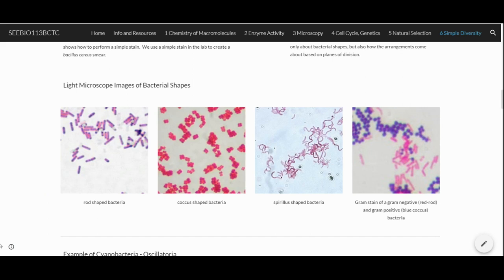Then the next, so microscope, usually what we have in microscope 1 is this one here, the first one. So you're supposed to draw this, right? So draw the shape of what's under the microscope. Draw the rod-shaped bacterium, Bacillus shape, and then draw the Spirillum-shaped bacterium.